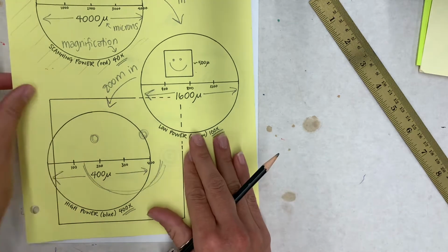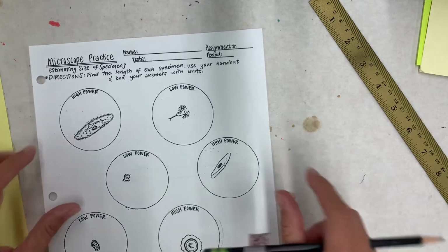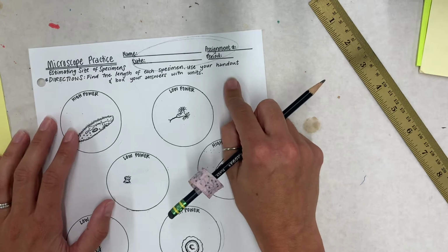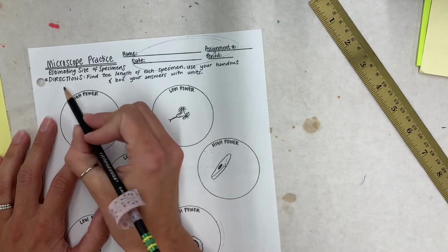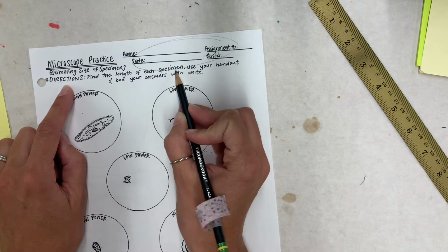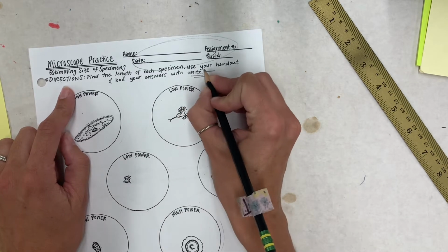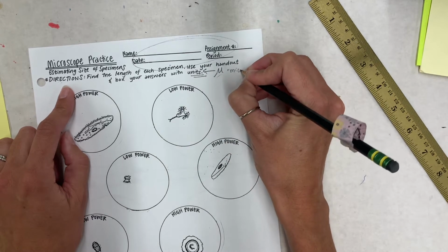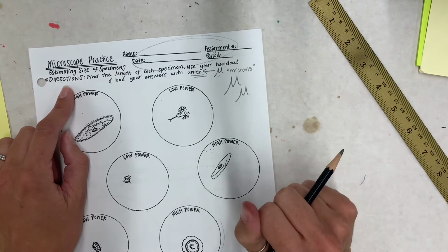So let's slide this aside and take a look at our microscope practice handout. On our microscope practice handout, make sure you fill in the top according to your teacher's instructions. And let's take a look. We have a bunch of specimens sketched out here, and the directions say to find the length of each specimen. Use your handout and box your answers with units. So remember, the units we're using are microns. It's like a fancy M. You might want to practice drawing what those units look like.